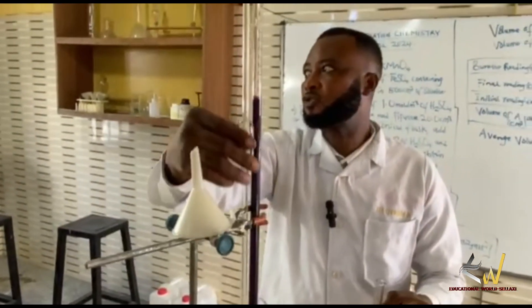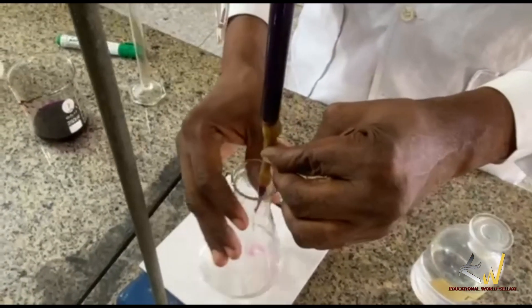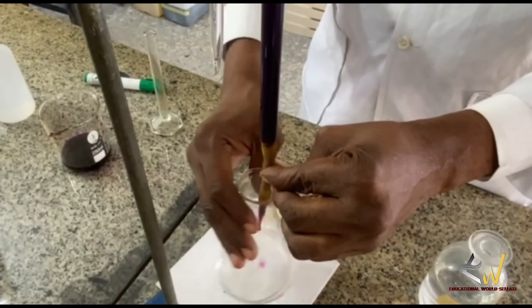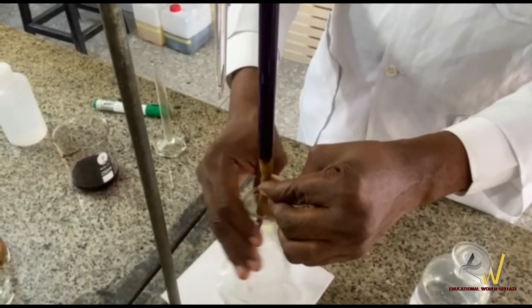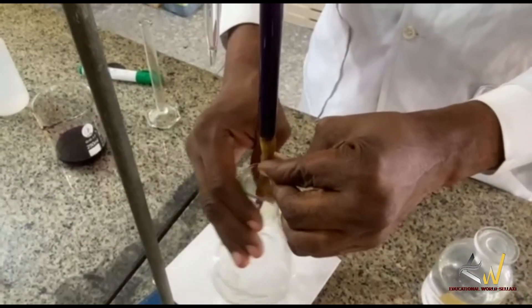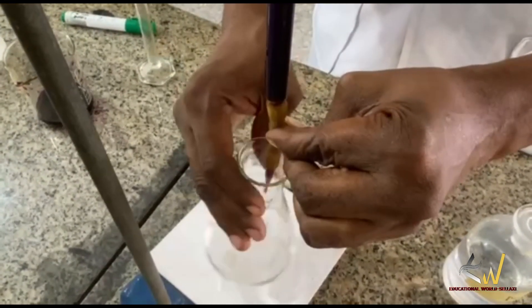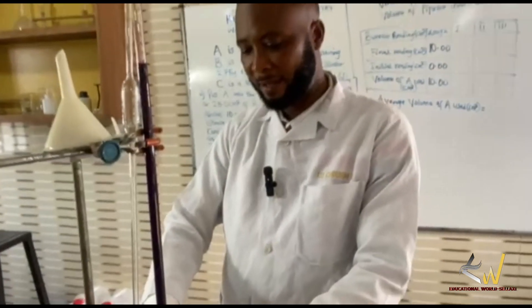Carefully place the apparatus. The purple color — keep it at the horizon again. The potassium permanganate is being reduced by the iron(II) salts. The iron(II) salt is acting as a reducing agent. At the end of the day, the potassium permanganate will oxidize the iron(II) salts.